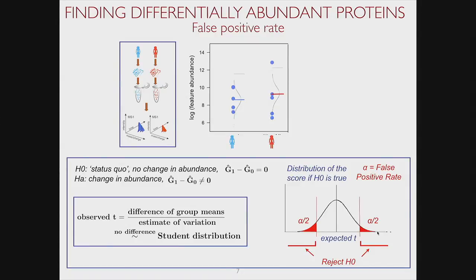And so then what we can do is to say, well, we can use this range of values as a benchmark. So now if we actually calculate this from the data and it falls somewhere in the middle here, we say, yeah, well, that's what we expect analytically, right? Okay, now theoretically, this means that the data has no evidence against what we assume. So there's no evidence against the assumption that there is no difference between the groups.